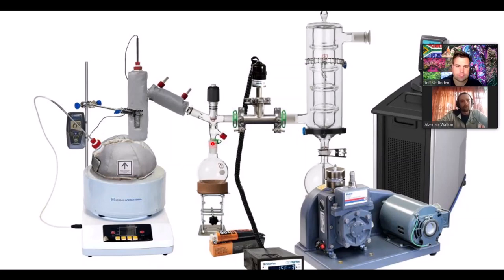I'll quickly jump in here. There are different options as well. Sometimes you get an example where it almost looks like a cow's teeth, with multiple collection flasks, and the idea there is to just twist it as the next fraction comes in. The idea is not to break vacuum every time, because if you have to remove a flask, you've got to break the vacuum. But correct, there are different methods. Some guys prefer something a little like this. Other guys prefer to roll around.